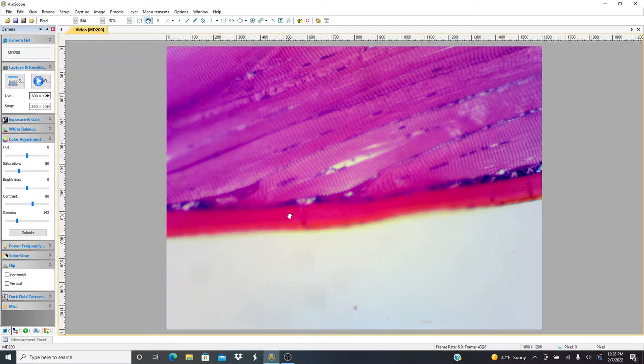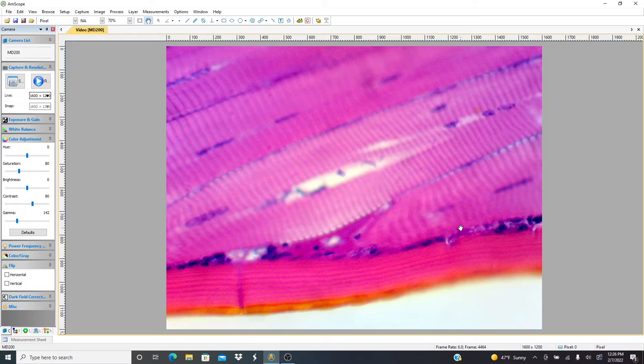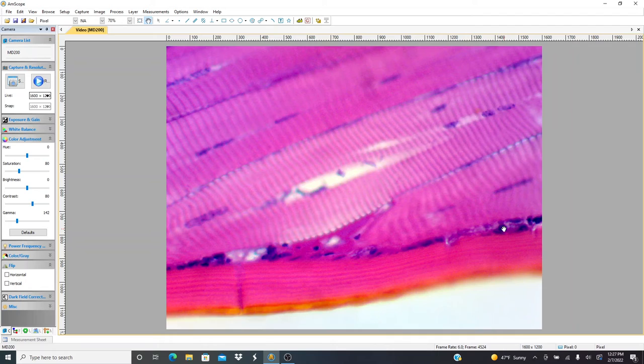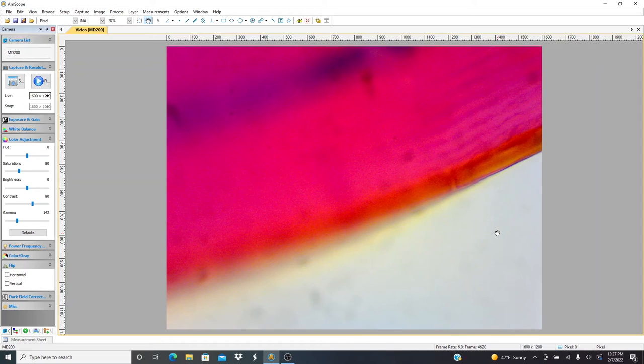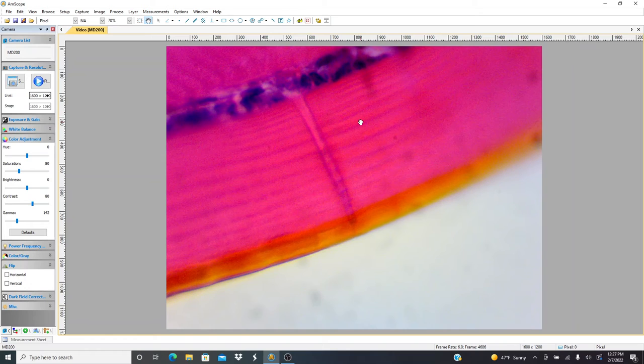It's interesting, this cell layer underneath this chitin layer. Obviously it has to be what maintains and produces this chitin. It's not producing these muscle cells, because these nuclei are the muscle cell nuclei, and those usually don't divide. So these pigmented cells are maintaining this chitin layer. And I can see why this thing has a red hue to it, because the chitin layer looks very red. It's also got this yellow outer layer right on the outside. Red in here. That looks like skeletal muscle. It's not.